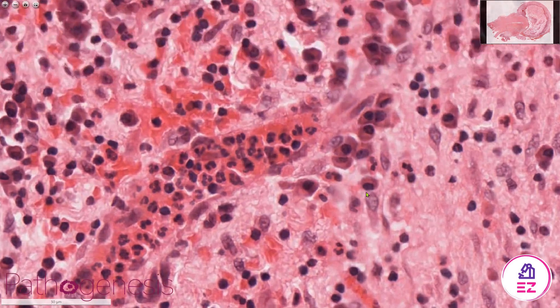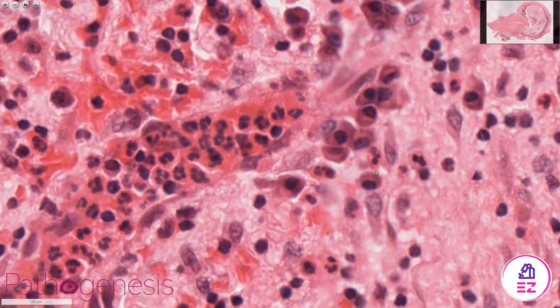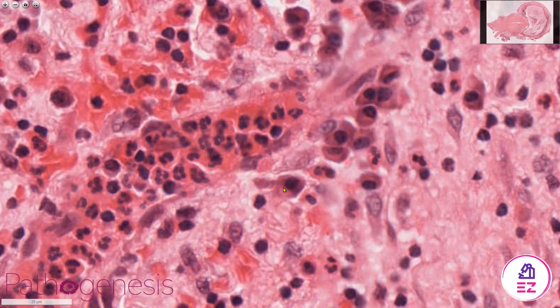The third type of cell is the plasma cell — there are several visible here. Plasma cells obviously make antibody and their nucleus is quite eccentric, so it's off to one side of the cell. As well as being bigger than neutrophils and lymphocytes, they have a lot more cytoplasm and sometimes look a little bit like fried eggs.